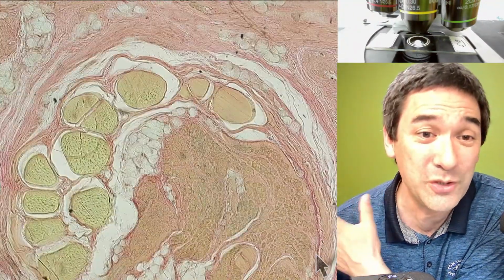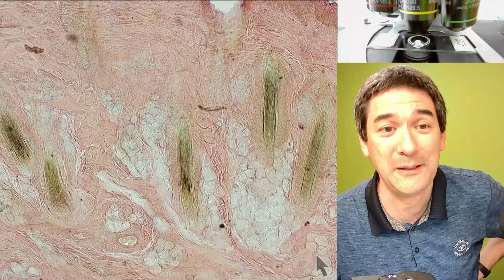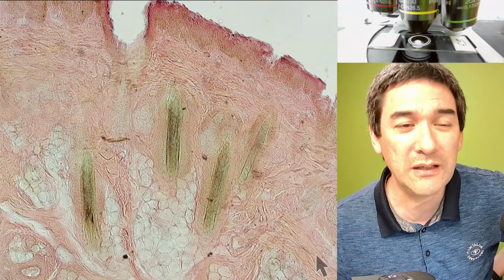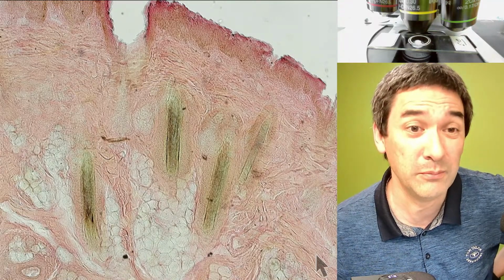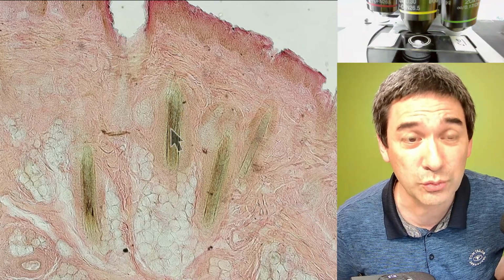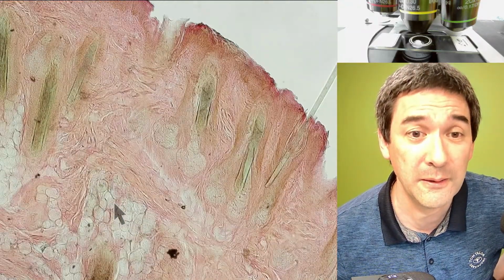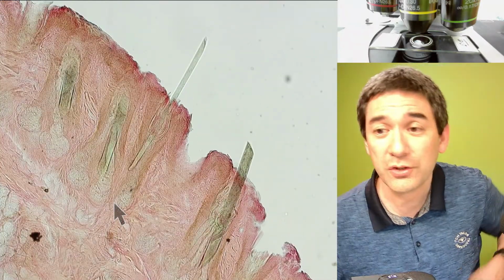But I think it's so interesting as a biologist. So I just wanted to show this to you again, because it's sometimes difficult to share the enthusiasm, of course, if you have to explain what it is. You see, that's a little bit the problem with those slides. So okay, tail of a monkey, but what? But if I'm saying, well, actually these are the cross sections of the fur of the monkey trying to grow out, then things start to make a little bit more sense. Here, for example, you see it quite nicely, how the fur is growing out. So just wanted to share this with you.